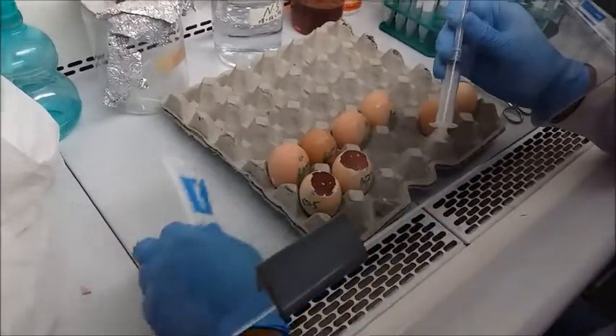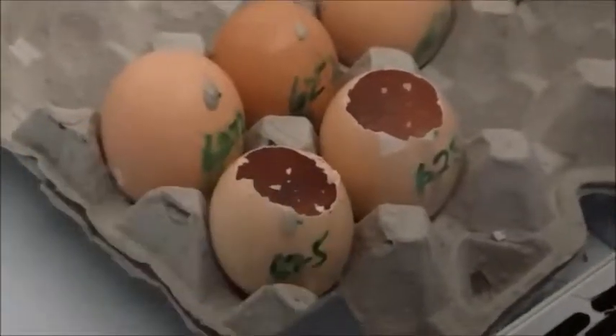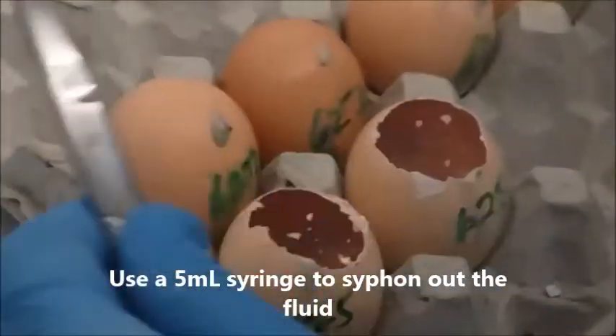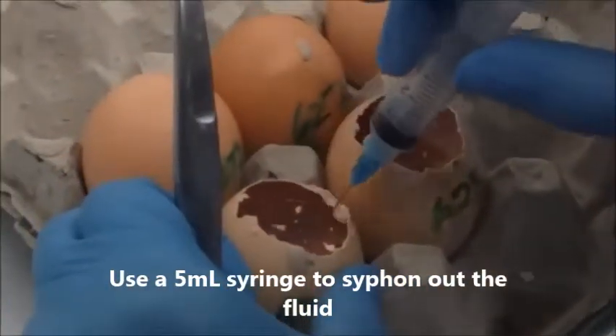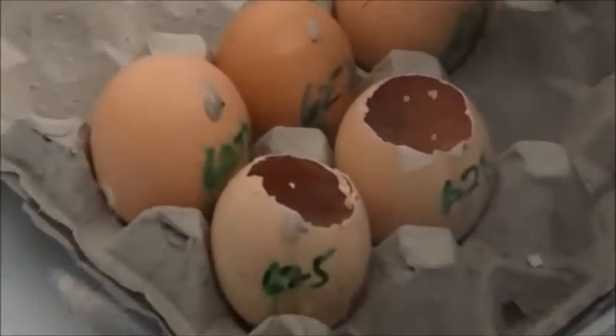If the eggs have been contaminated, you will find that out at this stage. These are clear eggs. Now you take a 5 ml syringe and draw out the harvested fluid from the side. Make sure that you do not disturb the yolk.